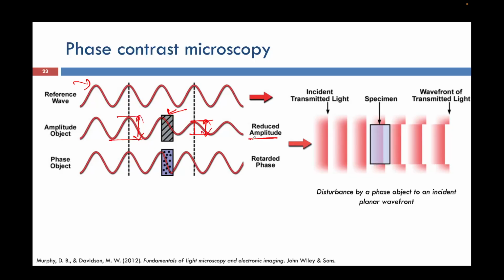But the phase object, what does it do? It does not change the intensity at all. If I am talking about intensity, it has not changed the intensity, but it has changed its phase.